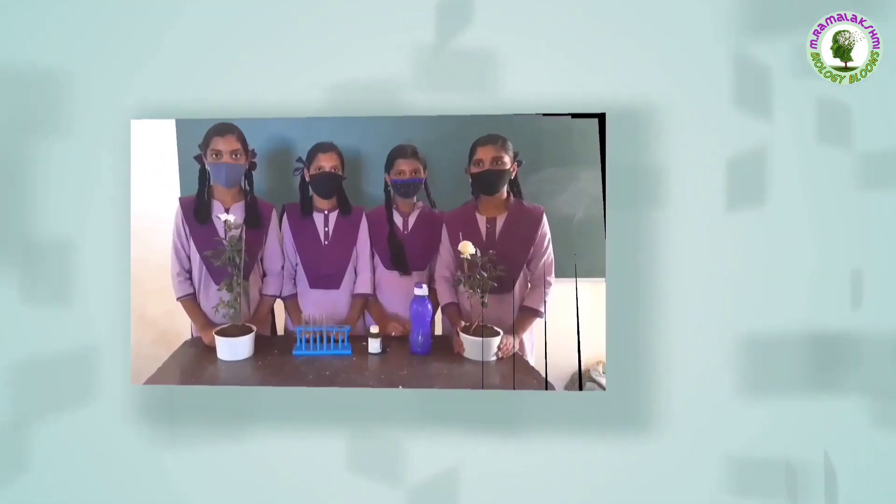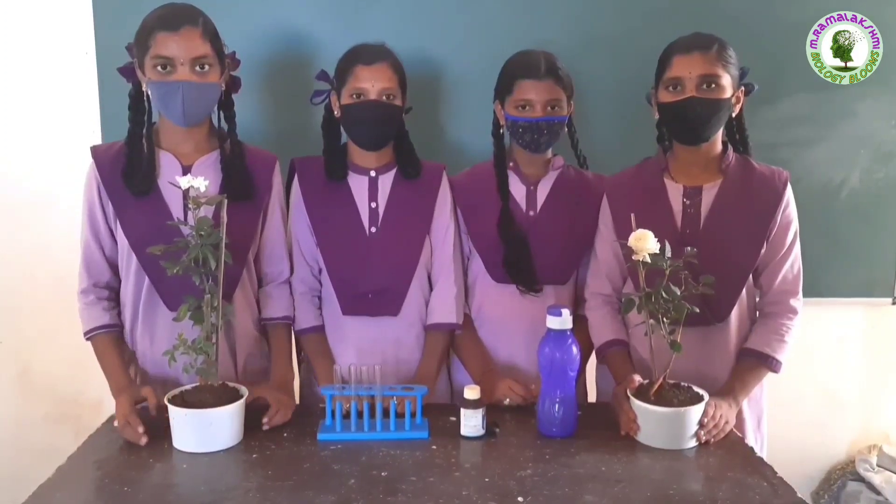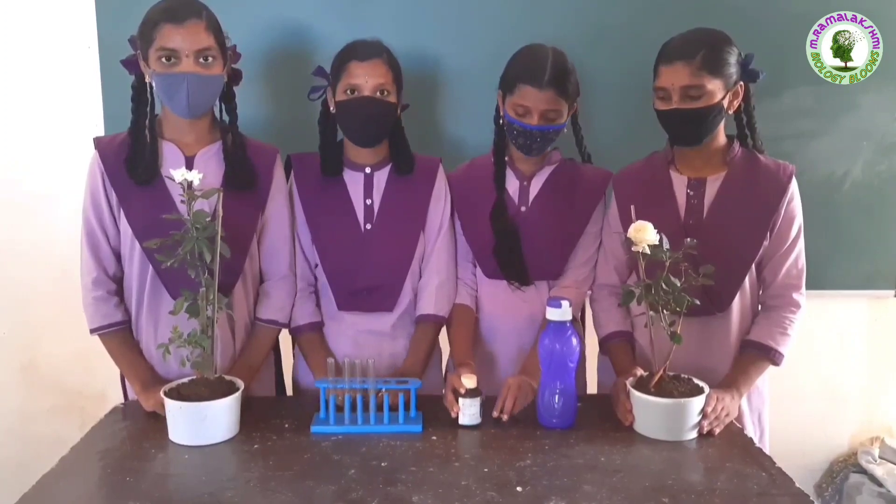Photosynthesis requires light energy. To prove that light is essential for photosynthesis, we will do an activity. To do this activity, we need two potted plants of the same kind, two test tubes, iodine, dropper, and water.